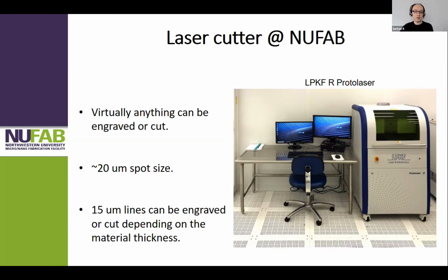It can be anything really. We used different materials in the past, like silicon is the most common one, obviously. We can machine into glass slides, steel sheets, or any kind of metal or polymers. That's pretty common in the lab. People use flexible polymers as their microfluidic devices, and they cut it with this laser cutter.